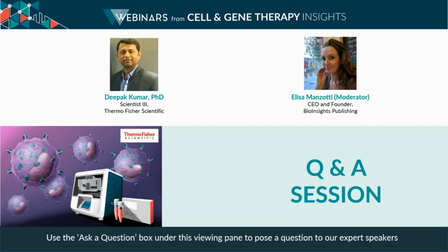And if you see, even on day 6, we are thinking that the NK cell cycle and cell maturation is more accurate on that day. So based on that, we are thinking day 6 is the best day. So that's why we chose day 6 for the editing. Yeah, that makes sense. Great.